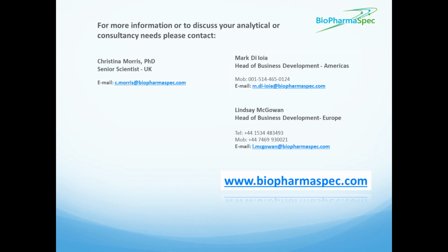So depending on the nature of the sample under investigation, to assist with this process, we've also spent time developing our own in-house data filtering methods. Along with this initial processing, it helps us to target the real identifications and eliminate further false positives. And as I've mentioned during the talk, we don't like to rely too heavily on the software alone. So we also perform extra manual reviews to assist in reducing any HCP oversight.